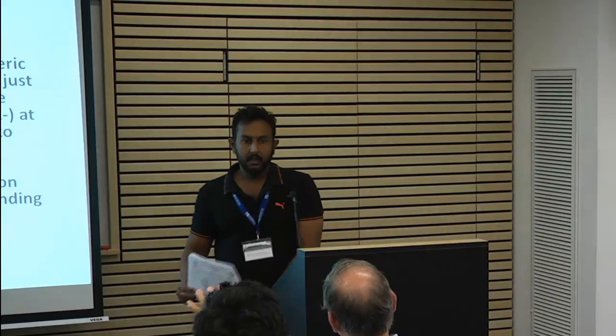Did you ever try to purify the protein and then do mass spec to see the cofactor that way? No, there is no cofactor. I think it's not getting bound with that thing. Maybe it requires a DNA bound structure to get it with the cofactor. So that's why we wanted to shift into DNA bound crystallization also. But we are trying with acetyl CoA and CoA and all those things, which is theoretically supposed to be the best possible cofactor.